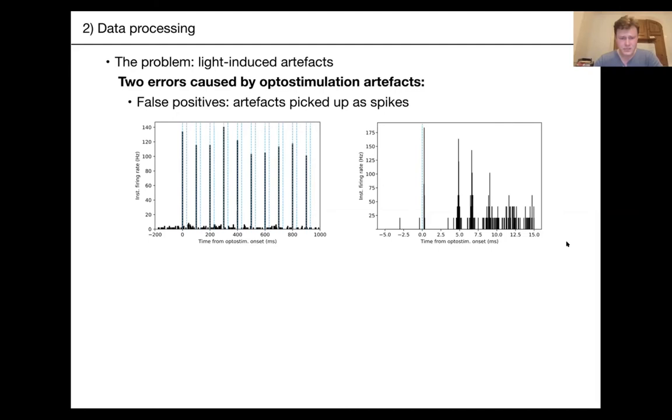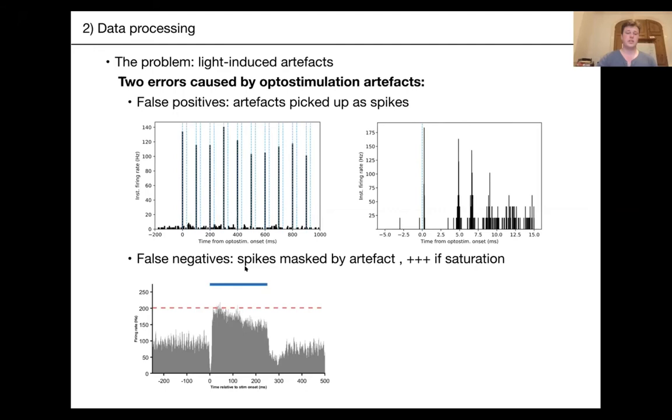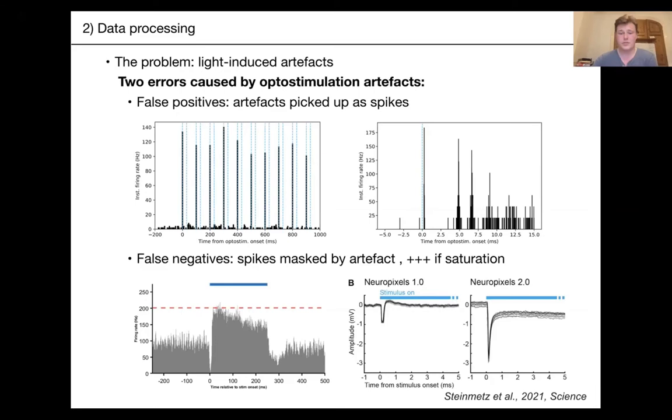The second risk is false negatives. The artifact itself — especially if it's saturating — can mask some spikes, and you'll see a trough at onset and sometimes offset of stimulation that isn't real. This example is from the Neuropixels 2.0 Science paper. Note that the data shown earlier was from Neuropixels 1.0. The 2.0 probes have a much wider voltage range and don't saturate as easily, but it really depends on your specific setup.